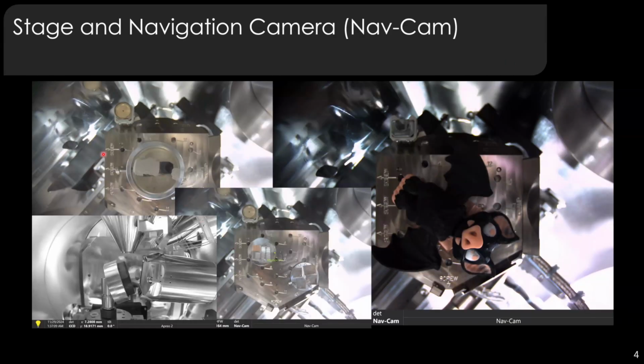So the core of a microscope is its stage. We do have a nice large stage and plenty of space within the microscope in that we can put samples that might be mounted in plastic, your traditional metallurgical samples, or we can have things on aluminum stubs and fit them into the stage here. Or in the case of when we're doing EBSD, we'd remove the main stage and we can put in an apparatus so we can have the samples tilted to 70° for collecting the EBSD data on the phosphor screen and using the forescatter detectors to collect backscatter. We can also have the EDS detector in to also detect X-rays.